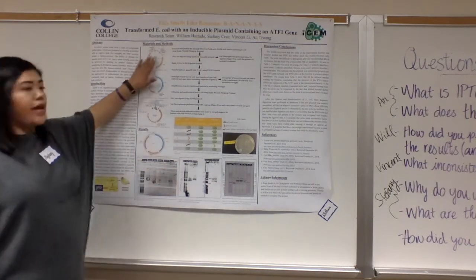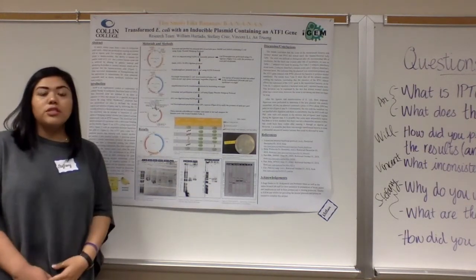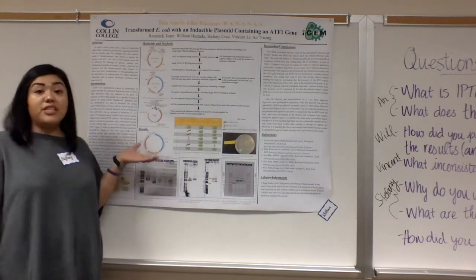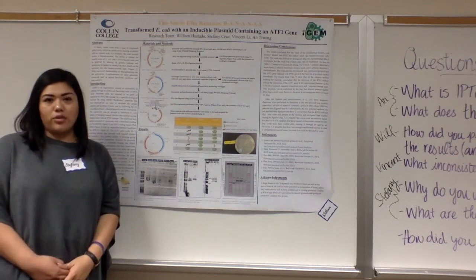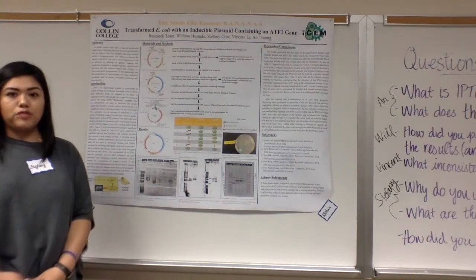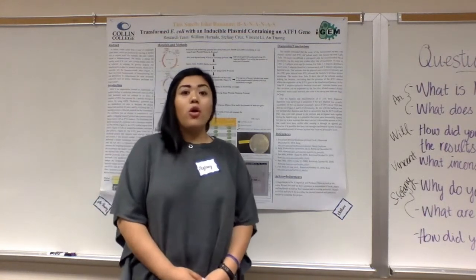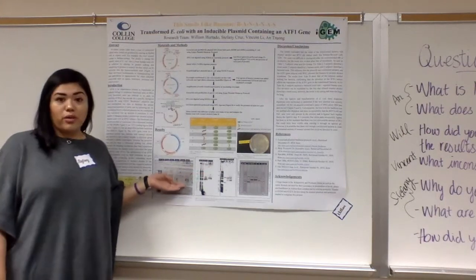Well, our part A and part B are in chloramphenicol backbone. We could have used other backbones like kanamycin and tetracycline, which we did, and our kanamycin backbone that we originally used did not grow any colonies. And so we changed to an ampicillin backbone that resulted in growth of the transformed bacteria. Some weaknesses that we found throughout our experiment was initially we did not have enough concentration of our parts.